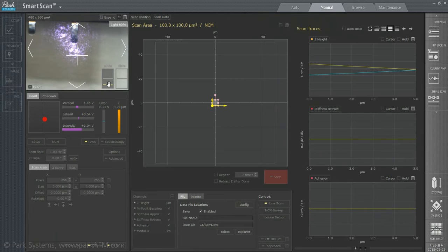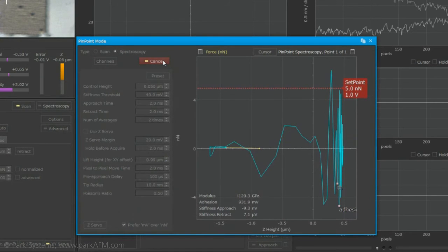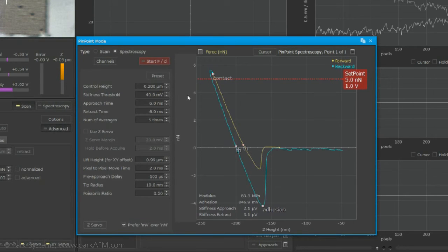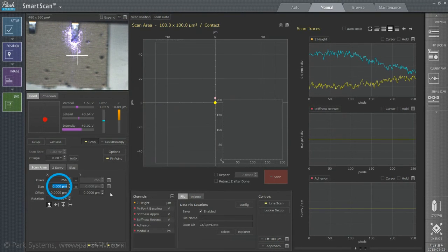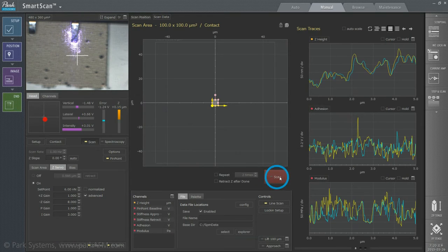After cantilever and laser alignment, the cantilever is brought down near the sample surface so that the desired imaging position can be found. After this, click Advanced, and then Pinpoint Mode. This will bring up the control panel. To be able to measure nanomechanical properties, a single FD spectroscopy must be checked by clicking the FD button. If the baseline is not shown in the FD curve, control height should be increased until it is. This action allows you to determine optimized vertical behavior within Pinpoint Mode. Now, switch into Scan Status and click the Enable Pinpoint button so the system starts its vertical movement based on the determined FD conditions. Then after setting the desired scan size, let the system start to collect FD curve data for each pixel point within the chosen area. Click on Start, and the main imaging process will begin.